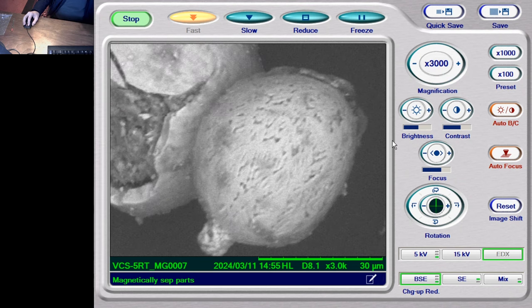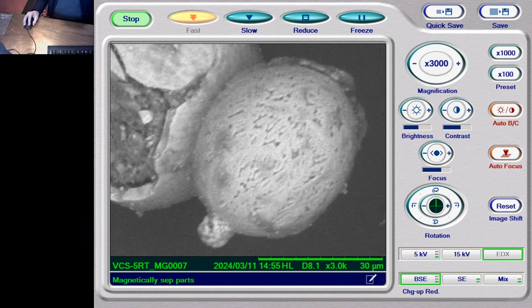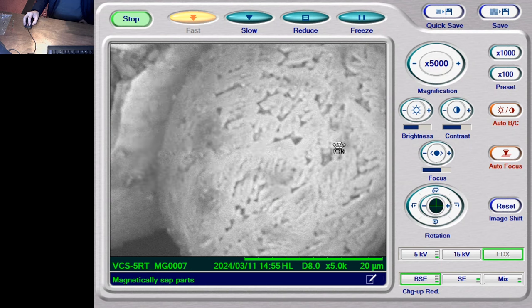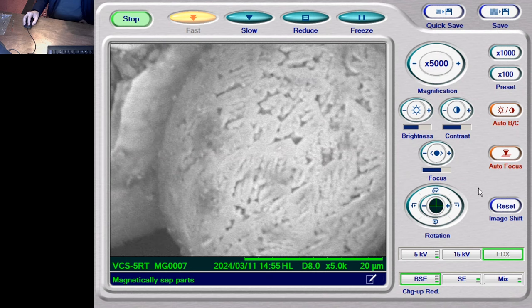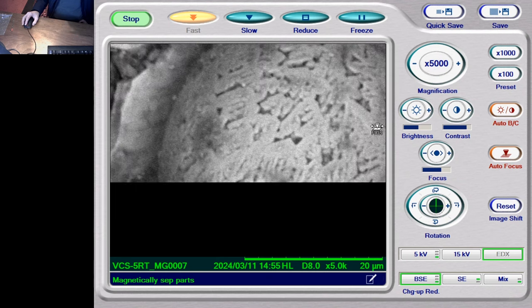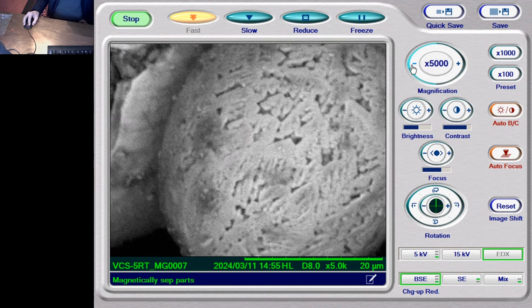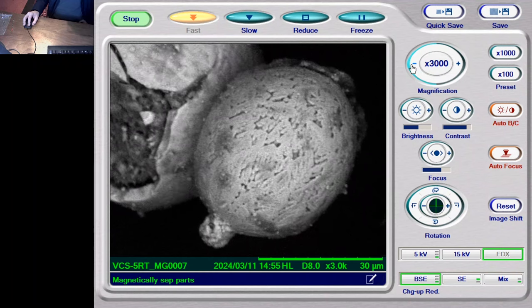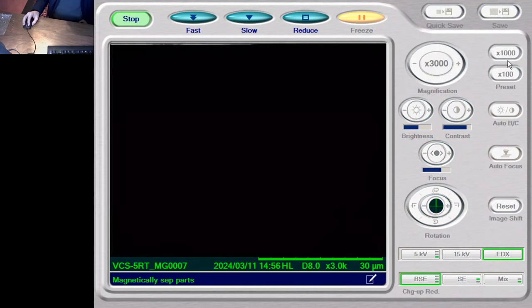So have a look at this. And this looks like the carbonaceous and silicon type of accretion band rolling around the outside. Let's see if we can get in there closer and focus on that a bit better. There we go. Look at that. That's nice, isn't it? So I would imagine this has a little bit more chromium in it because of where it's not perfectly meshing together. Okay, so we'll take a screen grab of that. Or a photo, let's say.